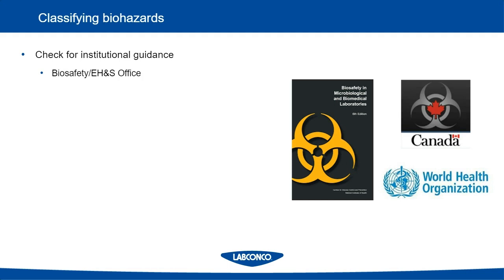But always, the first place you should go is to check to see if you have anything like that within your organization, because that's really your best resource in-house for how to handle and how to work with various biohazards or samples that you may want to bring into your university.